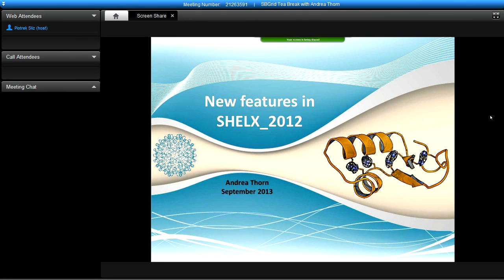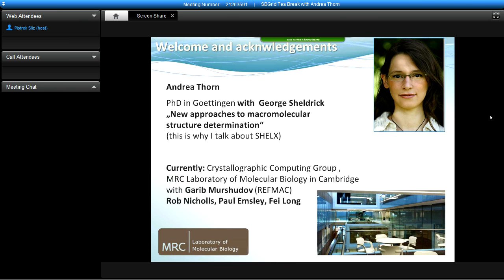I'll focus on topics for macromolecular crystallographers. And before I start, I was asked to show a photo of me, so that's me. And as already mentioned, I've done my PhD with Sheldrick about new approaches on macromolecular structure determination. And this is what basically qualifies me to talk about SHELX today.